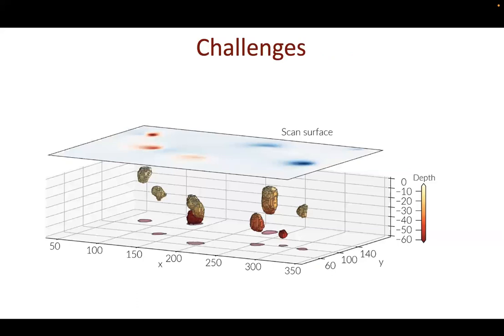So far, so good. That would mean that we solved this problem and that we could now do inversions for all our volcanic rocks. Of course, it's not that easy. There are a couple of challenges I want to discuss with you today and also how we try to work around them. The first thing we need to consider is the characterization of our sensors. The QDM maps are pixels, and these pixels have a surface area, quite often of 1.17 by 1.17 micron.